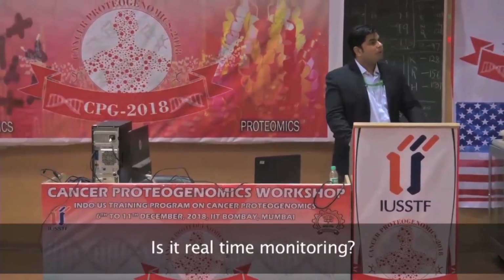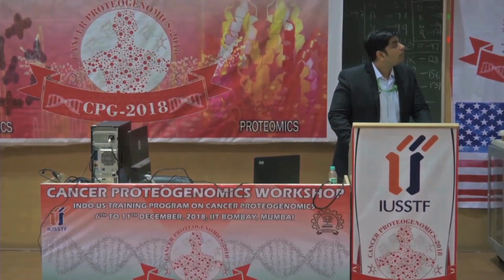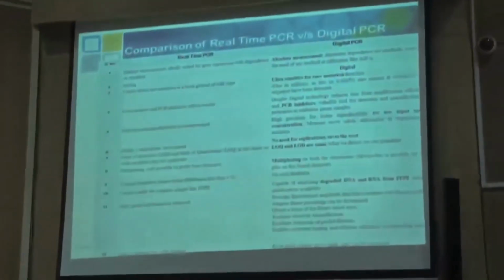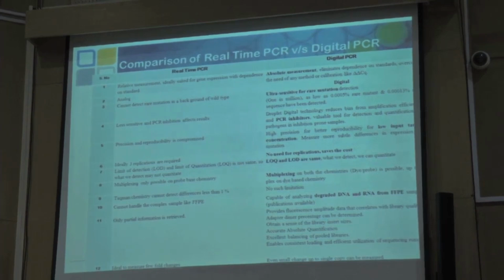It's an endpoint PCR, sir. So that's what I mentioned. There was an entire slide on that, right? Here. It quantitates it. The data that you get will give you how much ever DNA or RNA was present in your sample. It gives you copies of your amplified DNA in each sample in copies per microliter.